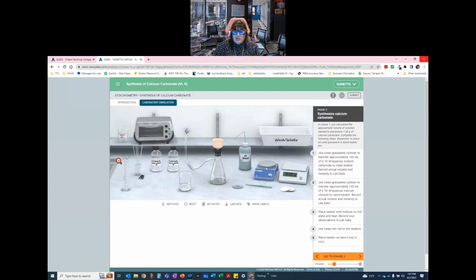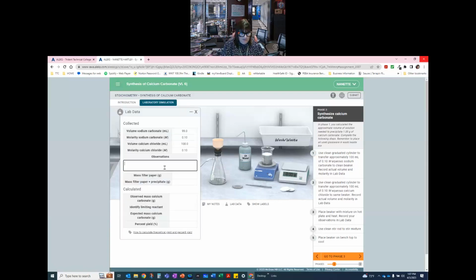Okay. So I'm going to tear this. I'm going to put a piece of filter paper. I have to add this. Sorry. And then put that in there. I'm going to use heat it up. Hooray! Made a solid.